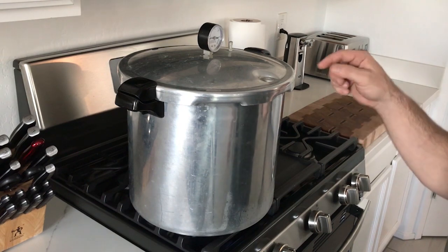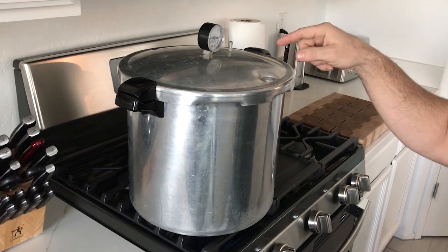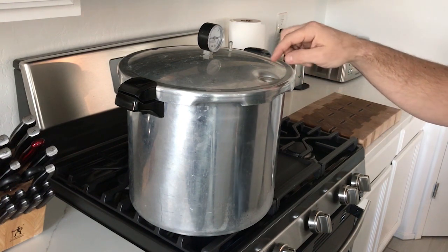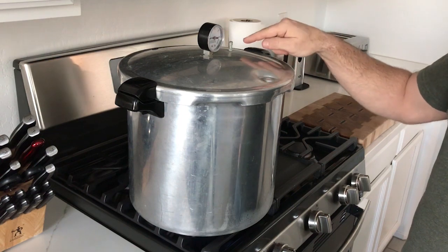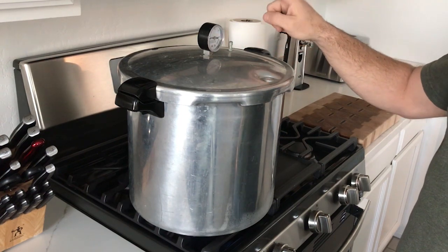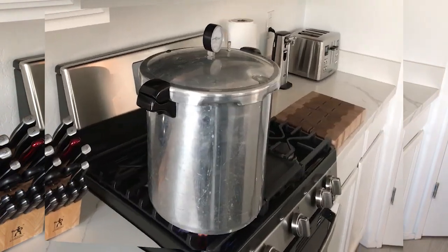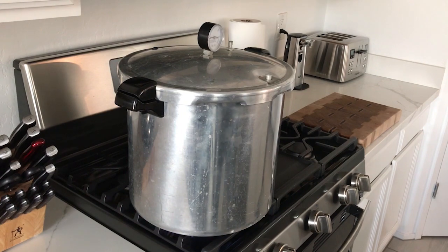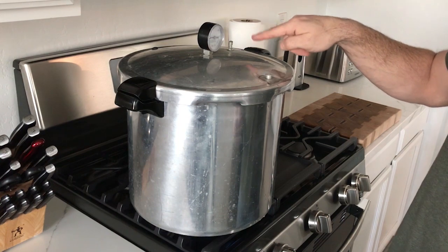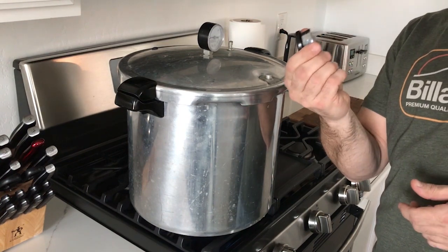Light your burner and get your water boiling to build pressure inside the pressure cooker. Once the pressure builds up and this little valve right here has popped up, you want to see some steam coming out of this valve over here. Let that steam off for 15 minutes before you put your 15 pound rocker on there and start building pressure.